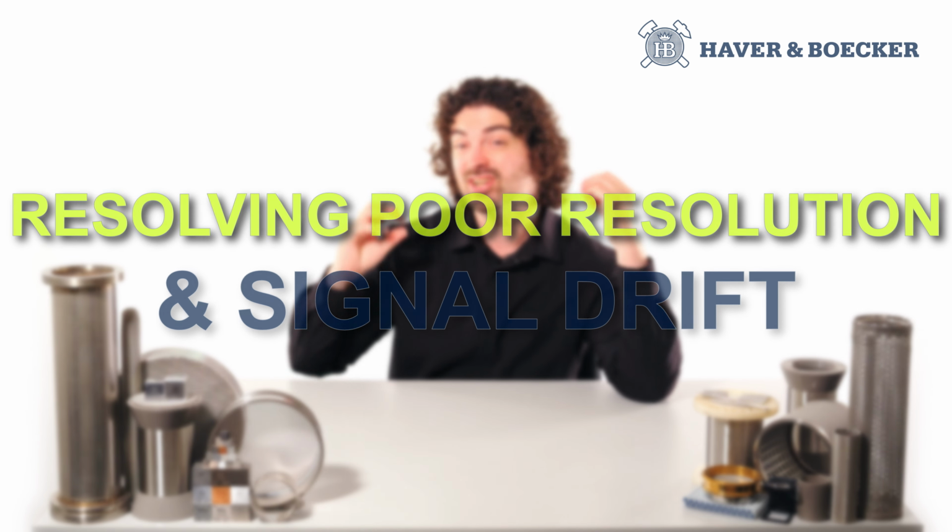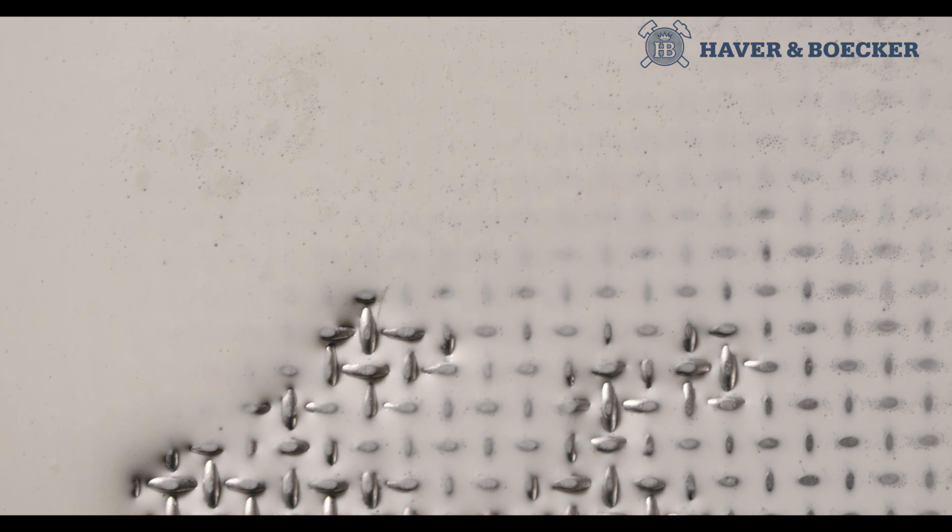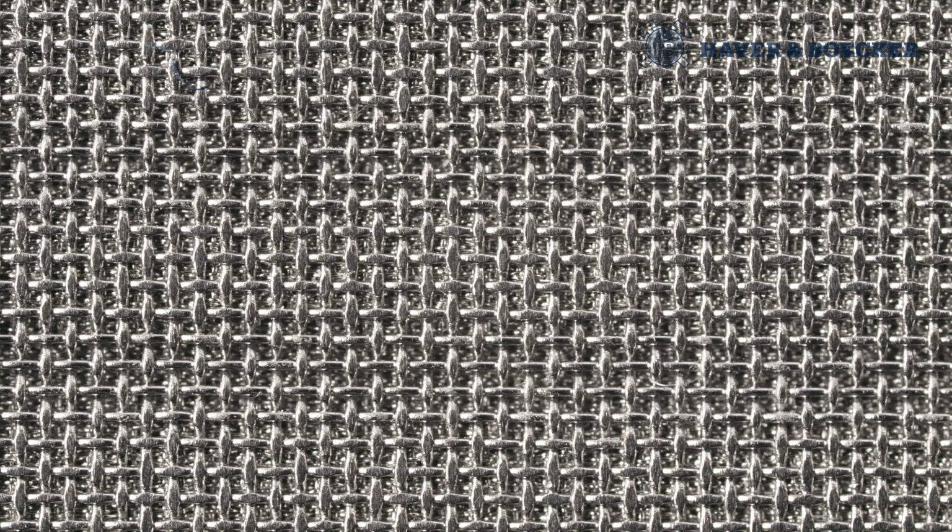Chromatographic resolution relies on sharp, separate peaks as sample compounds rinse through the packed resin bed. Decreased resolution or baseline drift typically stems from band broadening, the physical spreading of the sample zone. This occurs when an uneven fluid front forces sample molecules to take unequal paths, creating overlapping peaks. To stop this dispersion, the design and open area percentage of the bed support are critical.